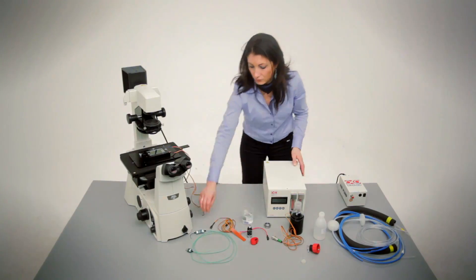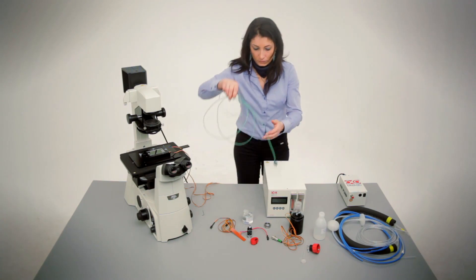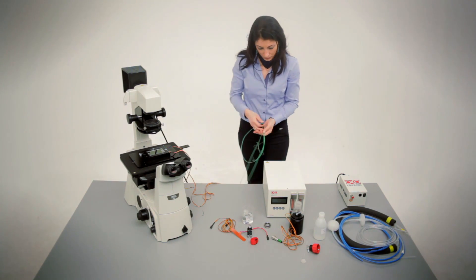A simple manual calibration of the objective heater can be performed by connecting the external temperature sensor to the UNO controller.